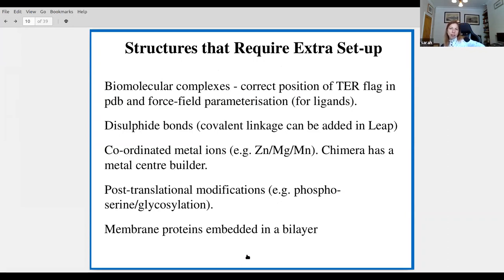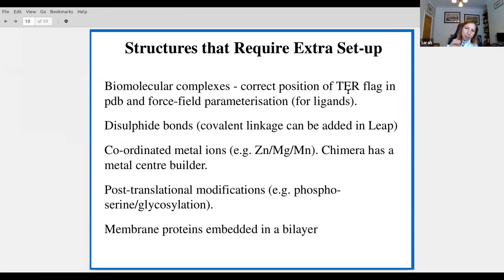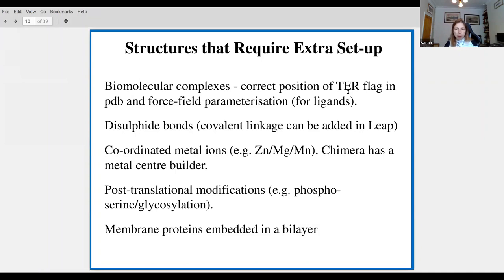If you've got a system that requires extra setup — just extra thinking — a few tips. If you're running a simulation of a biomolecular complex, it's really important to have a TER flag between your protein and your ligand, otherwise things are going to go horribly wrong. If you have more than one molecule, you need TER flags every time there is no covalent bond between adjacent PDB entries — ligands, counter-ions, etc.